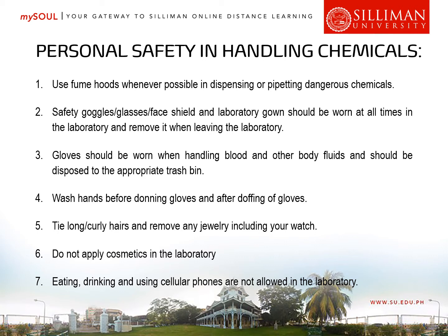Number one, use fume hoods whenever possible in dispensing or pipetting dangerous chemicals. For chemicals that emit large amounts of fumes, fume hoods are very useful because they prevent us from smelling the vapors emitted by our dangerous chemicals. Number two, safety goggles, glasses, face shield, and lab gown should be worn at all times in the laboratory, and removed when leaving the laboratory.